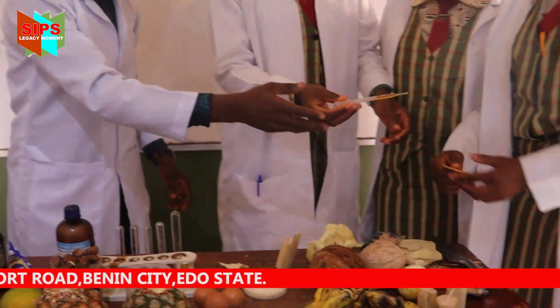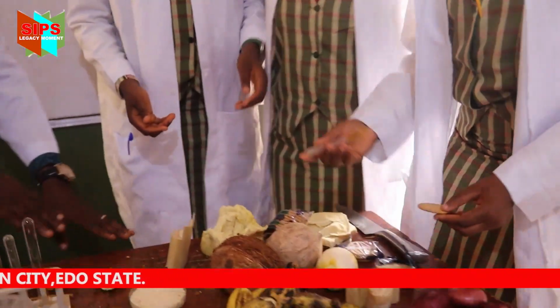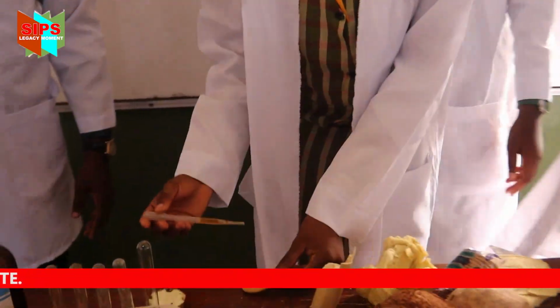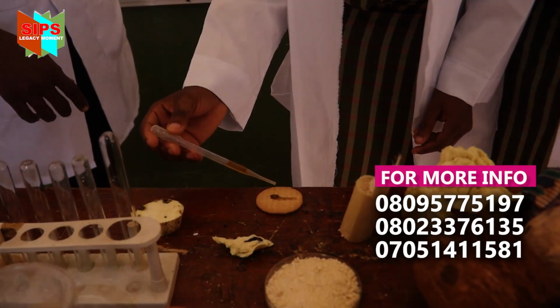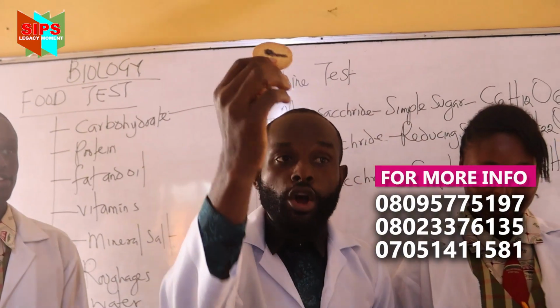Now let's see for the biscuits. Let the person for the biscuit do her own. Come this way. Now, place it on the table. Let's see whether it's true, it will give us the blue black. Add. Now, what color are you seeing? Blue black.